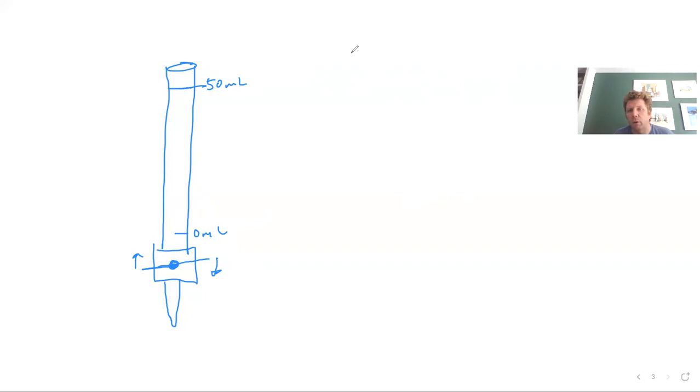Now, whenever you get your Buret, like I said a moment ago, you're going to use a 0.75 molar solution of sodium hydroxide. You're going to put that into the Buret, and you'll fill it basically all the way right up to that 50 milliliter line. Now, one important thing to remember about a Buret is I drew this line right here, 0 milliliters. Let me go back to the blue that I was using a moment ago. 0 milliliters.